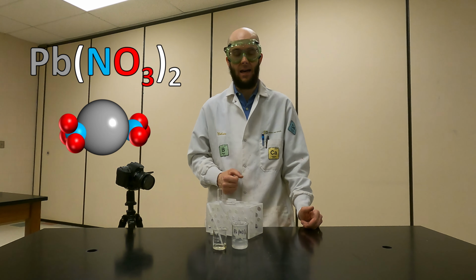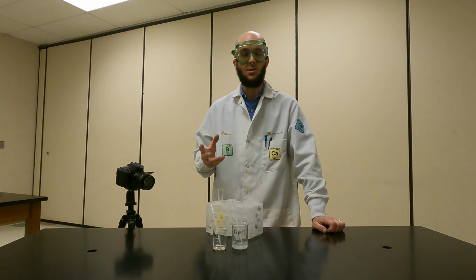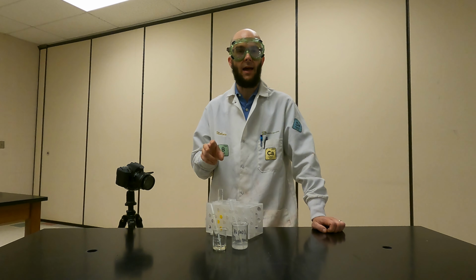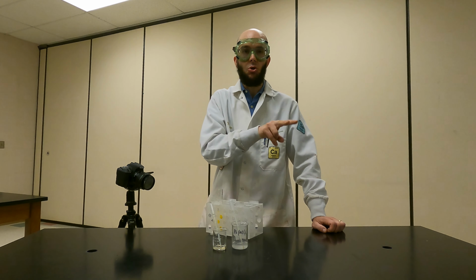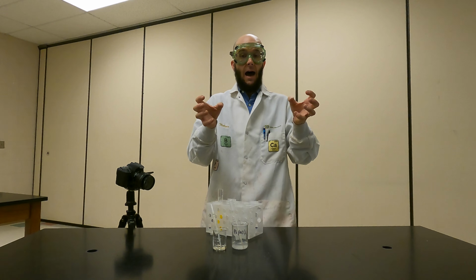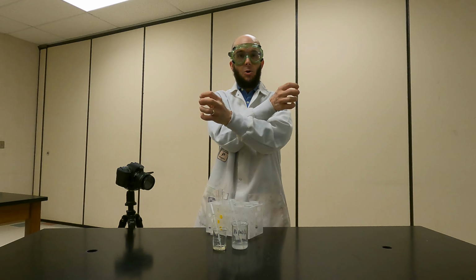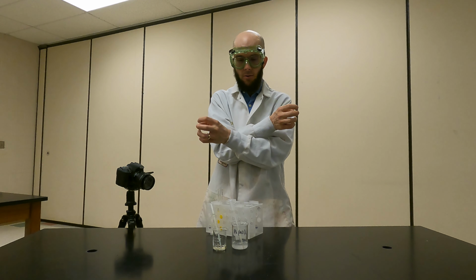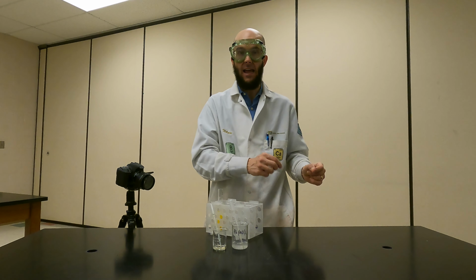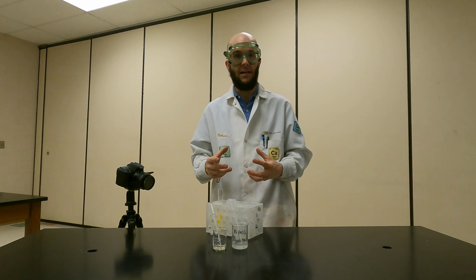And keeping in mind that this is a double replacement reaction, there's really only a handful of products that can be. And this reaction demonstrates a pattern that we nearly always see in double replacement reactions. We always begin with two ionic compounds that are in the aqueous state. And then, when those compounds react, the ions that they're made of switch places, right? They kind of swap partners. And very often in the products, we get substances that are not aqueous. So we have a change in state of matter.